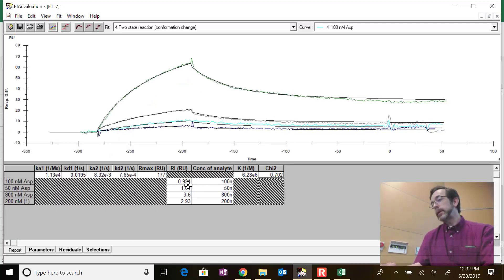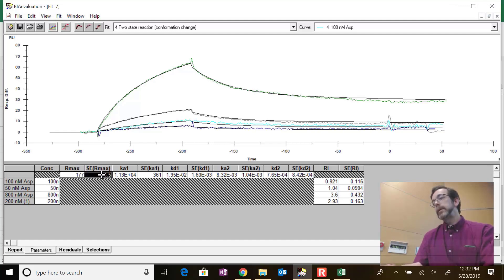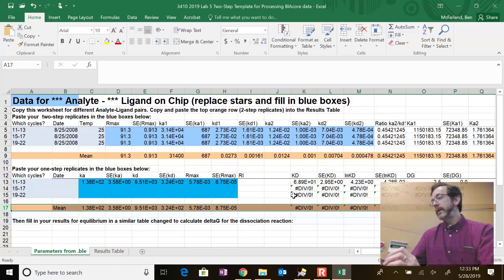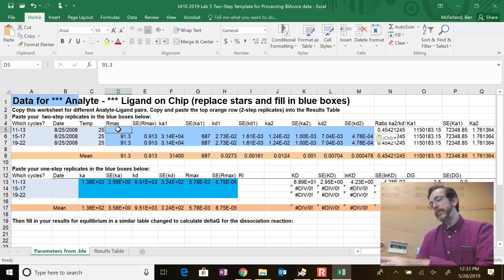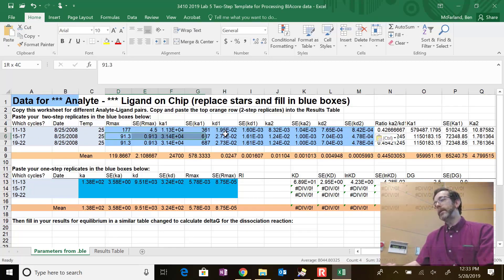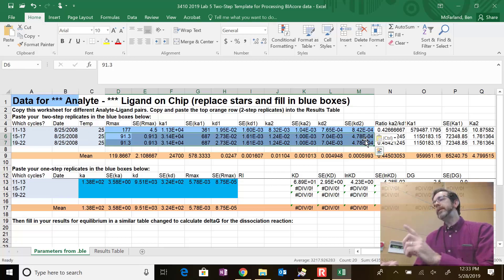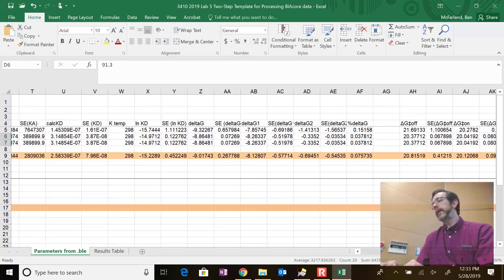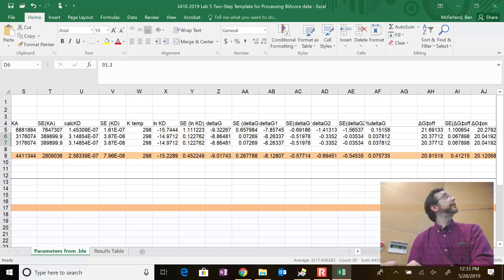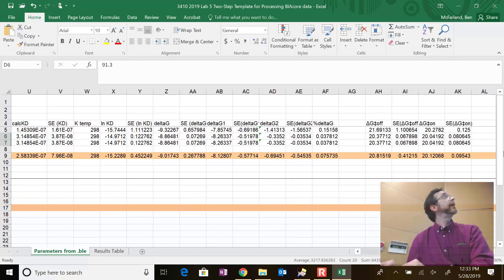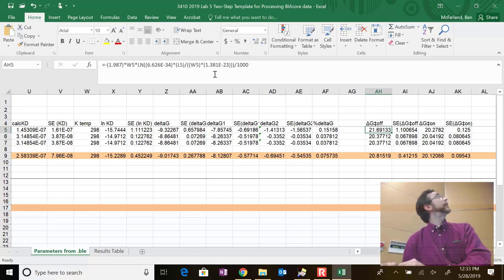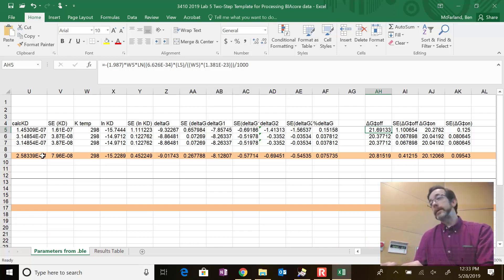The Rmax values are pretty similar. Looking down the list, it's giving me a K but actually doesn't calculate it correctly. Go to the parameters tab again, copy all the data directly from there starting with the Rmax row, and it automatically does all those calculations for you. These are all expressed in physical chemistry terms: you get Delta G1 and Delta G2 - free energies for the different steps - and it even calculates delta G for the transition state on and off from the k-on and k-off. The formulas in the sheet call different cells and reconstruct the math.